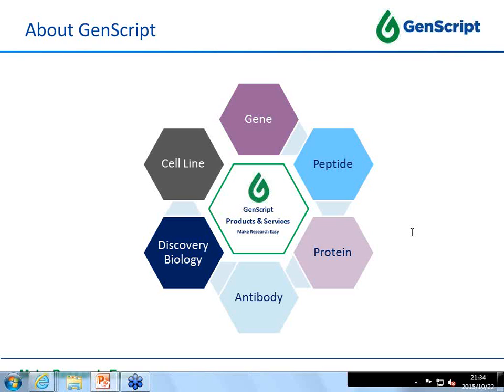Great. I think there's one more question. They're asking about the feed system. Do we have a feed system? Can you tell a little bit more? Which system? Sorry. The feed system. Oh, yes, we do have the feed system. You mean how do we generate the new feeding medium, right? We are also doing this. We have different components by hand, and we test them. We generate some recipes for the specific feeding medium, but to keep consistent results, at the moment we just use the commercial one.